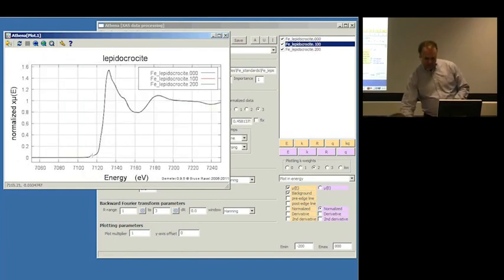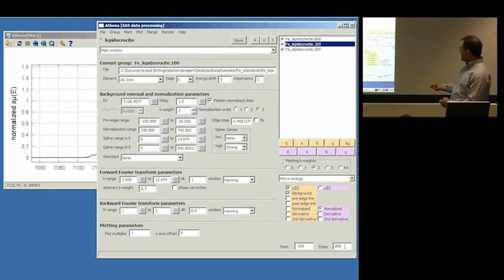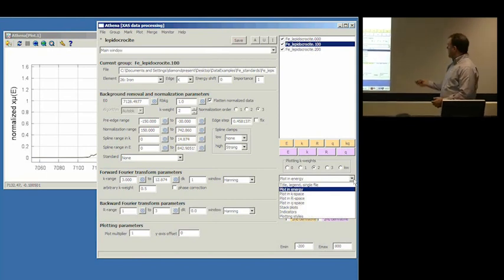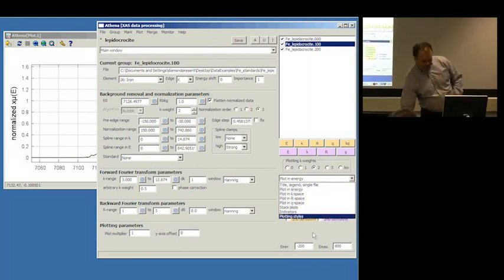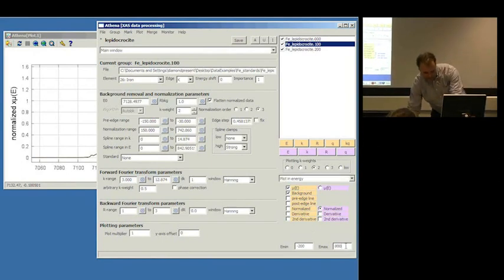I can also change the plotting range down here. Each of the tabs in this drop-down menu is a different grouping of plotting tools, and there's one for each space: energy, K, R, and Q. Each of them has a box at the bottom for minimum and maximum, which is the range over which you plot the data. So you can also do something like this, just change the range over which the plot will happen, and now if I hit the purple E button, this plot happens.